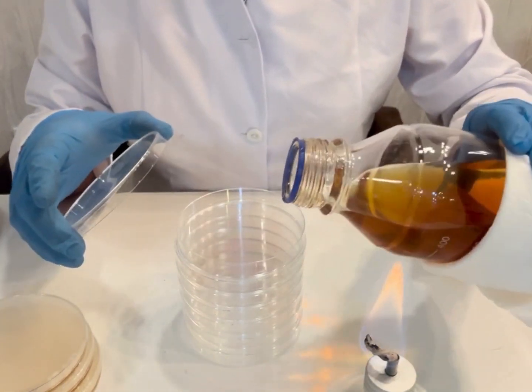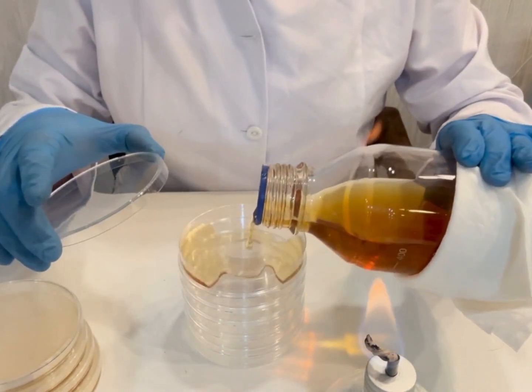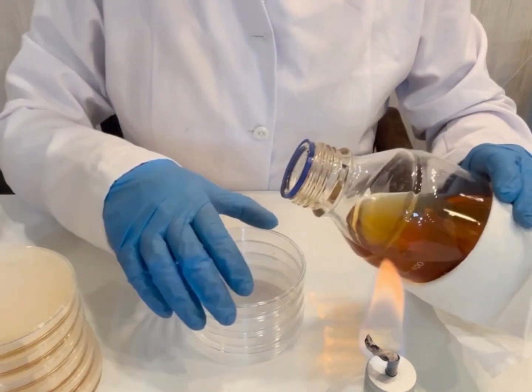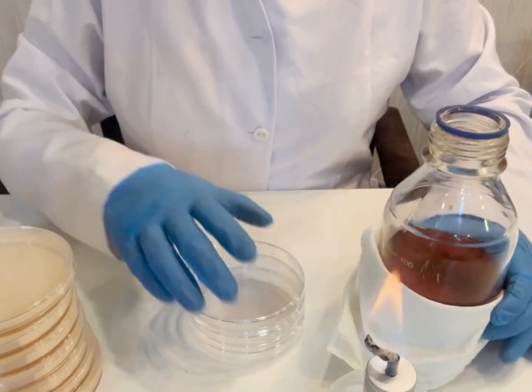Broths and solid media can be stored, once sterilized, at room temperature, but to reduce their dehydration and the consequent change in the concentrations of their components, it is preferable to keep them at 4 degrees Celsius.